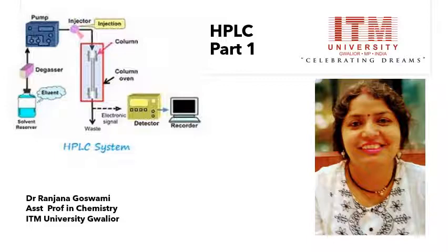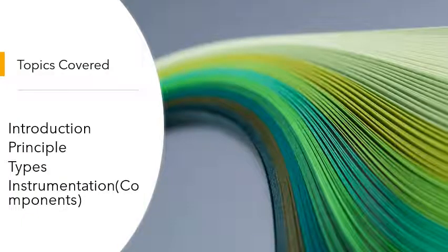Now we are going to learn another advanced type of chromatography, that is high performance liquid chromatography. In this lecture, we should cover the introduction part of the HPLC, the principle involved in the method, various types of the HPLC, and the instrumentation part. We discuss the components involved in the instrument HPLC.